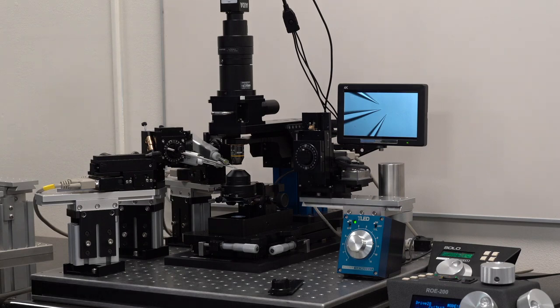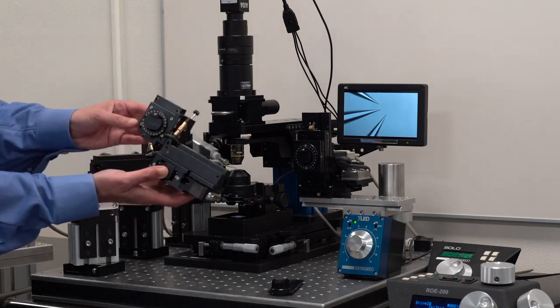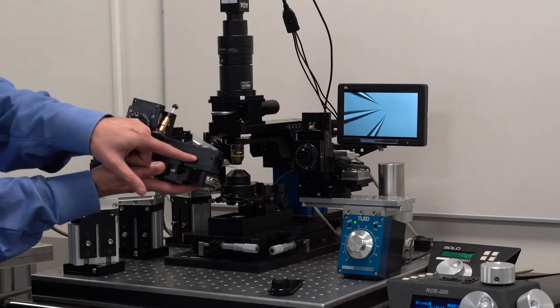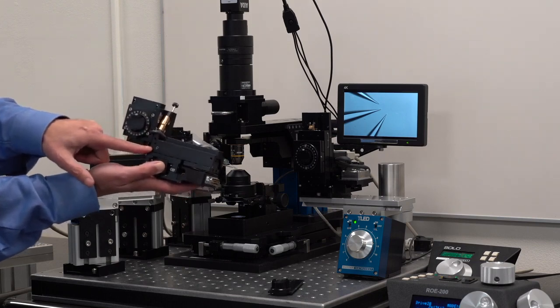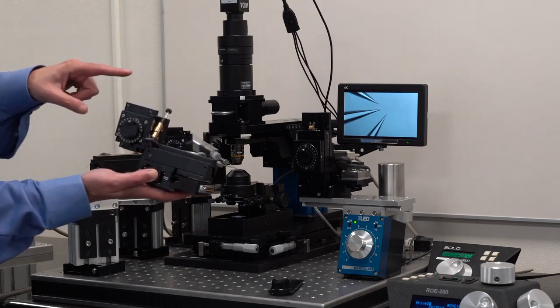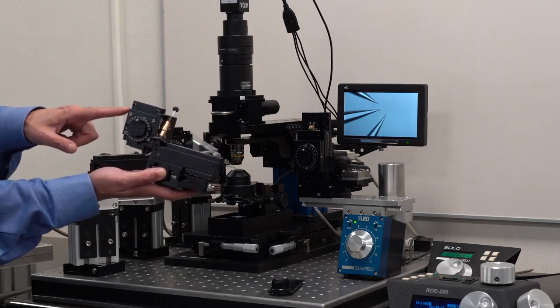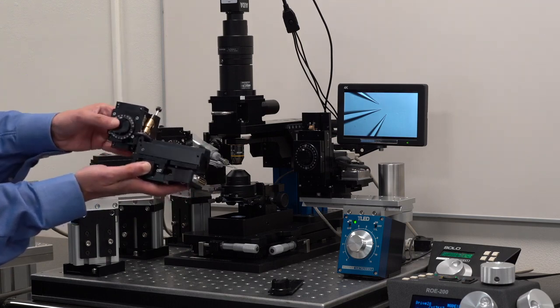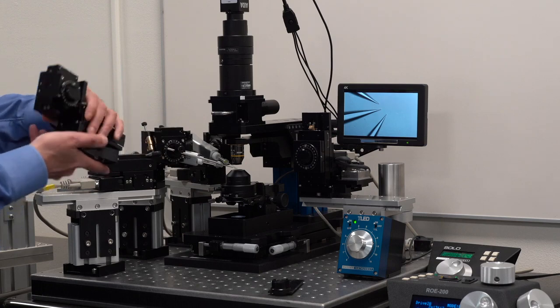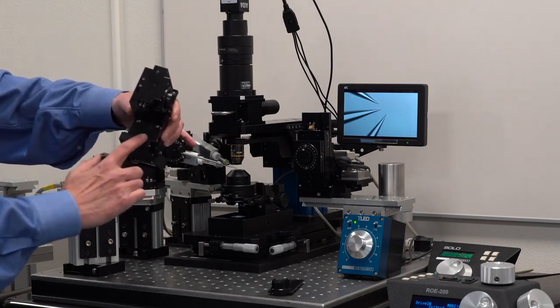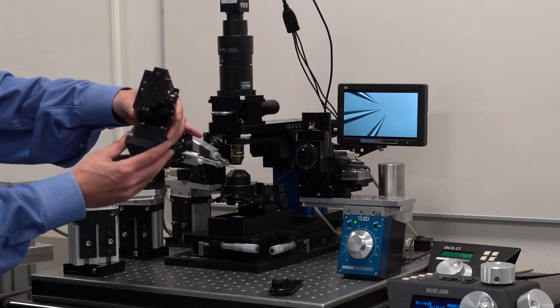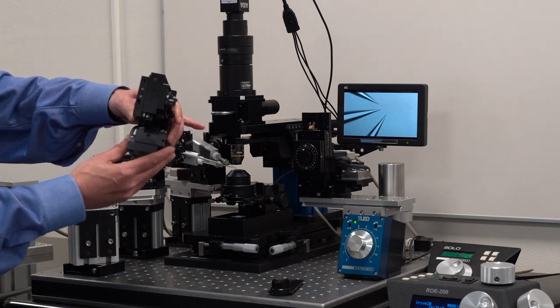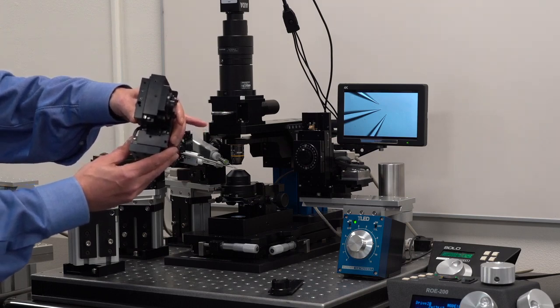The narrow format manipulator has a very long traveling X-axis, 15 millimeters, traditional 25 millimeters in Z. And the way we have made it narrow is by having the Y-axis here only travel 12.5 millimeters.